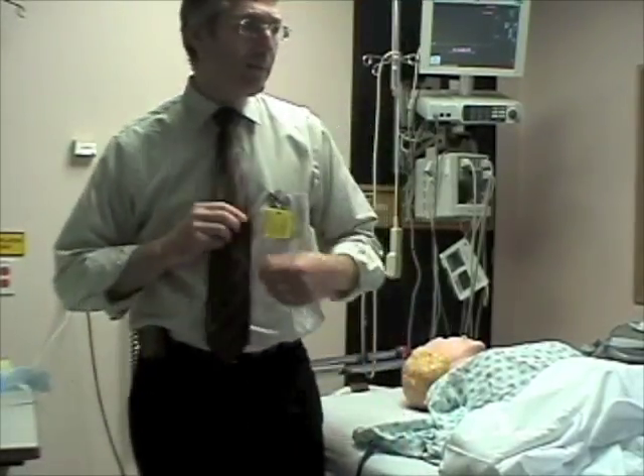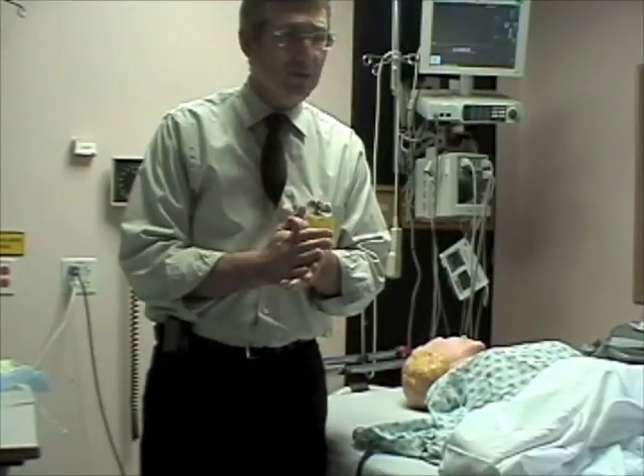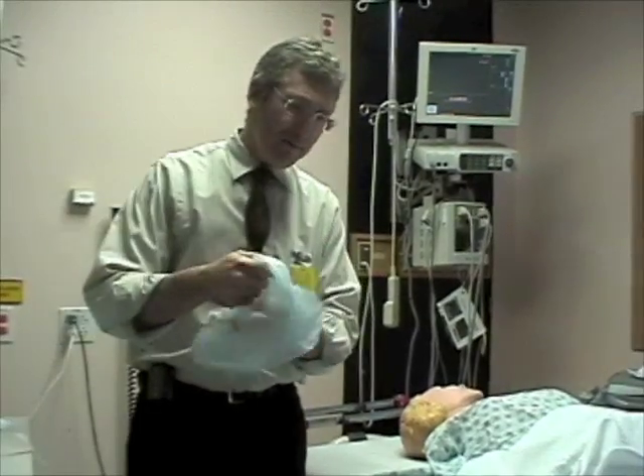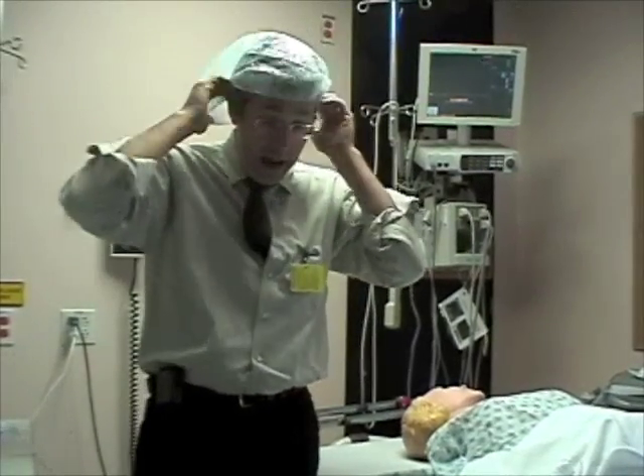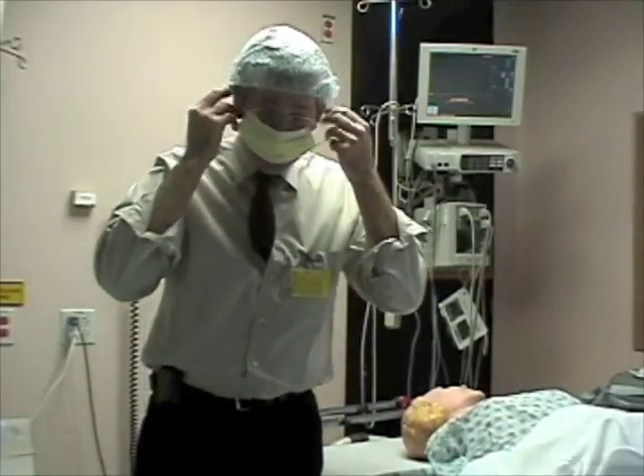Proper sterile technique involves gowning and gloving. What you should do before you start is take the alcohol-based solution and wash your hands with that, if not also wash your hands at the sink. You have to have a full hat and mask. Remember, these should go on beforehand, obviously.